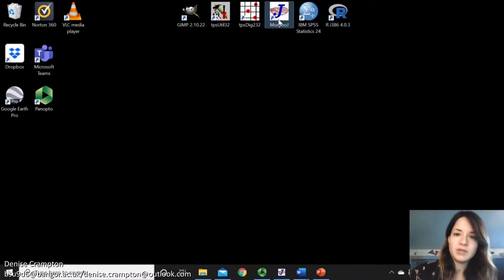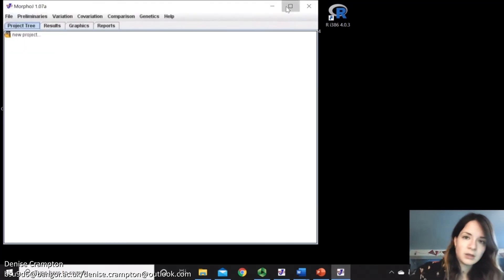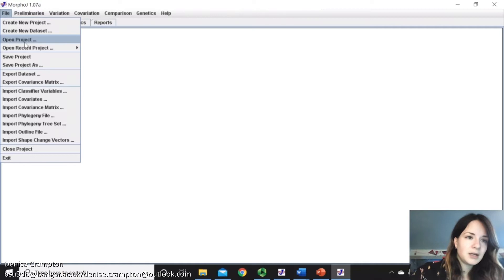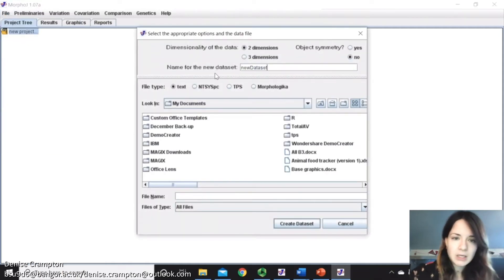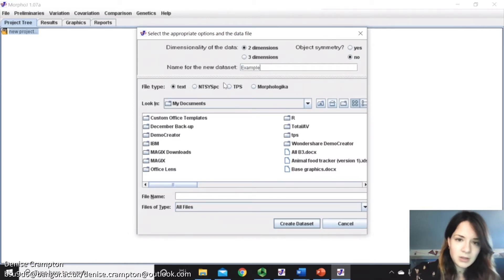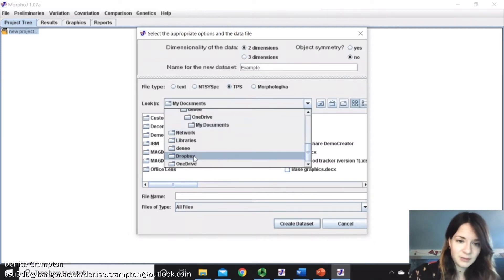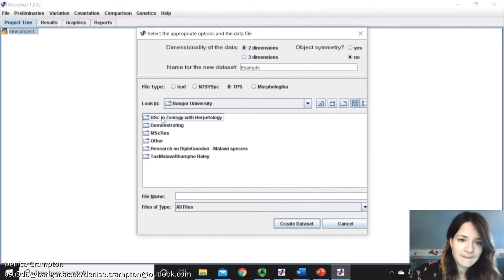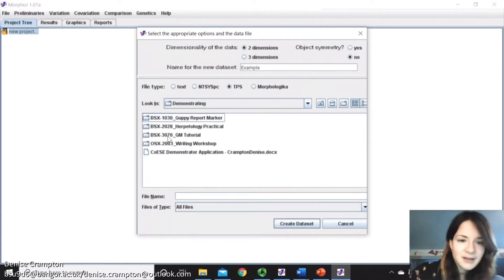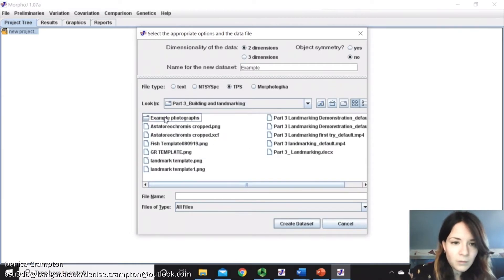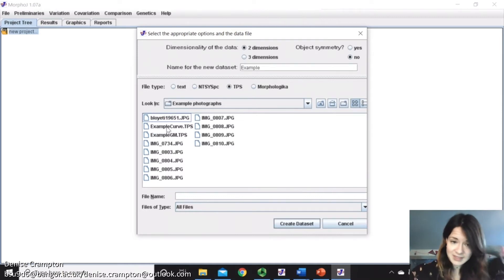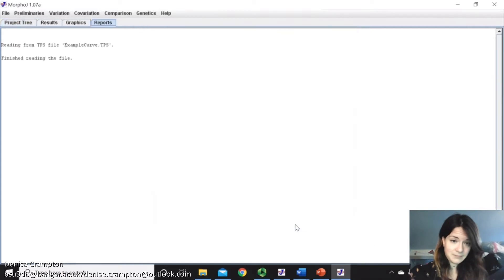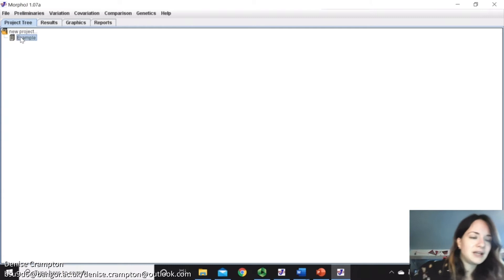Open up MorphoJ. Then we're going to go File, Create New Dataset. Make sure that when you import your data, you pick TPS, because if you have text, you'll come up with an error message. Then find your data. So then you'll have your TPS file that you created in TPS-DIG. So Create Dataset, and then you've got your new data there.